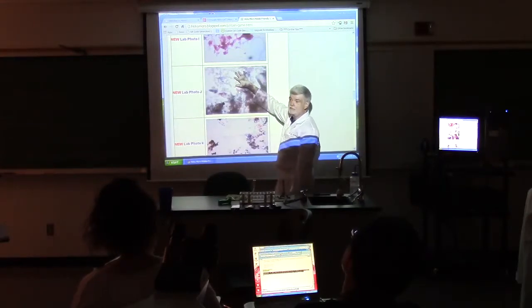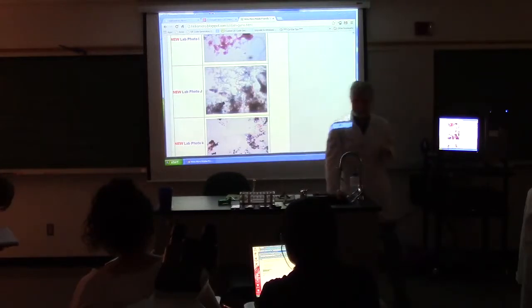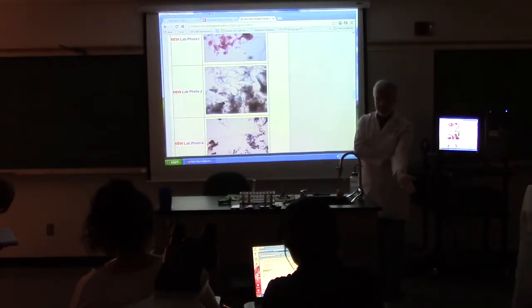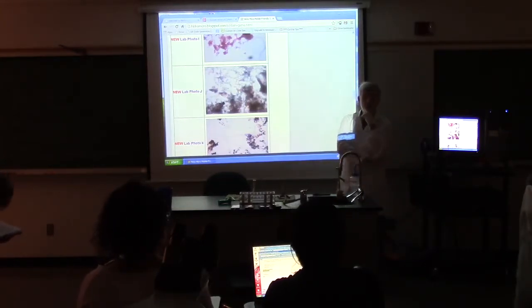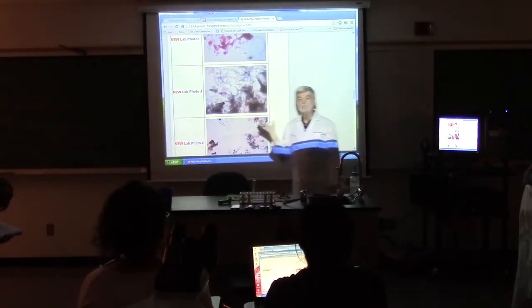then it's mycobacteria. And here's something really strange. When you look at this today, when you do mycobacterium on the endospore stain, the green things are going to look bigger than the pink ones, because it's an optical illusion that darker colors look bigger than lighter colors. It's just a thing our brain does. Can endospores be bigger than the mommy that made them? No. So if the green things appear to be bigger than the pink ones, it cannot be endospores.